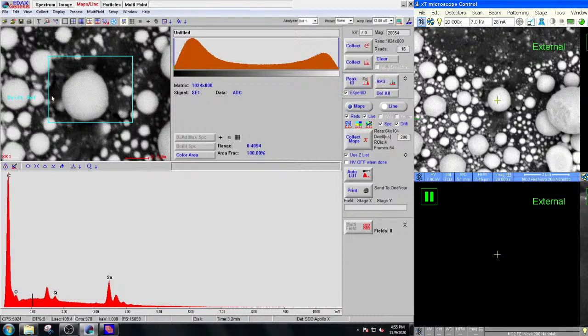Right, and you see here the drift reference is in the middle. I don't think you can move this around. I think that's why I say you want to have an obvious feature right there in the center. So now in reduced mode, I can draw my small box. Let's map right here, just to see if we can pick up some of these small little guys.